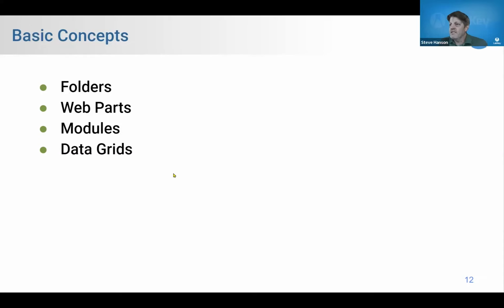So anyways, to get into some more detail here, I've got 4 concepts that are a great way to start getting your head around LabKey in detail. These are great admin concepts to know. The first is the concept of a folder. A folder is totally fundamental to LabKey. Everything exists in a folder.